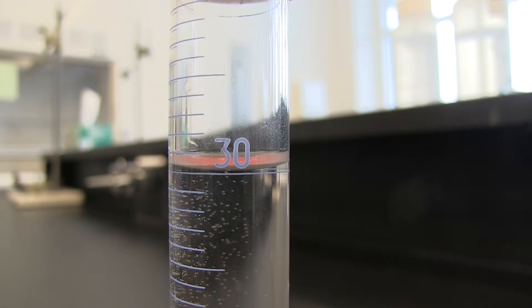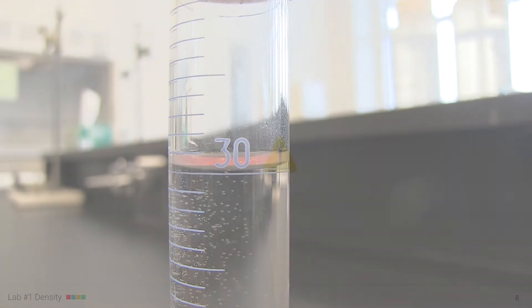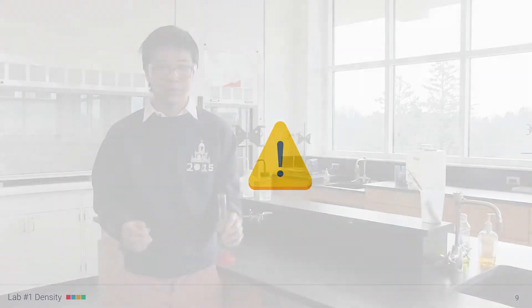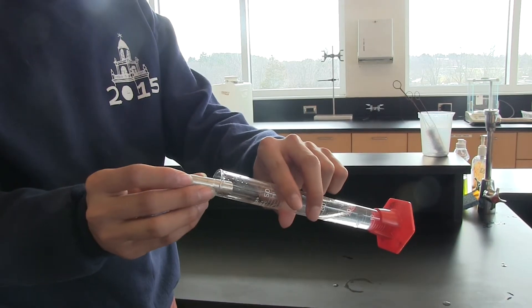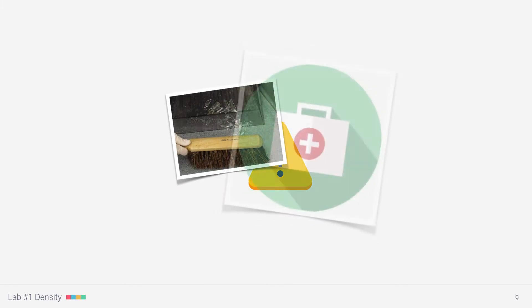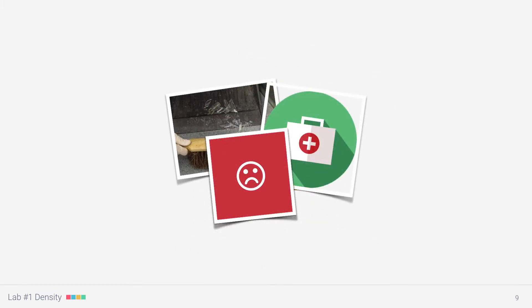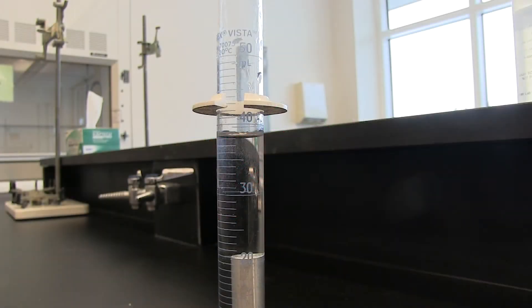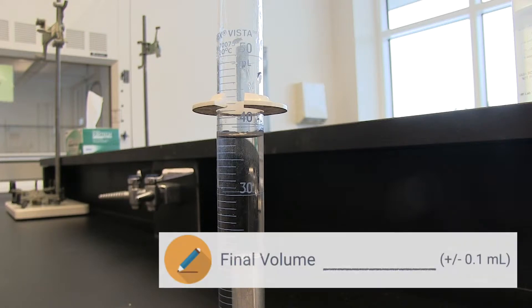Next, we need to add our solid to the cylinder. For this part, be careful. A ton of students have broken their cylinders by just dumping the solid in there. Instead, tilt the cylinder to the side and carefully let the solid slide down. Dealing with broken glassware is not fun. Now that our solid's in there, we can record our final volume. And remember, from the bottom of the meniscus.